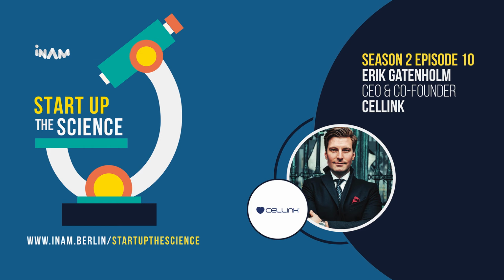So I did a fairly quick Google search around and see, is there a material that can be used for bioprinting? And what I started to find was that there were mostly just printer companies out there. So there were a lot of companies that were selling these very, very expensive printers that would cost $300,000.